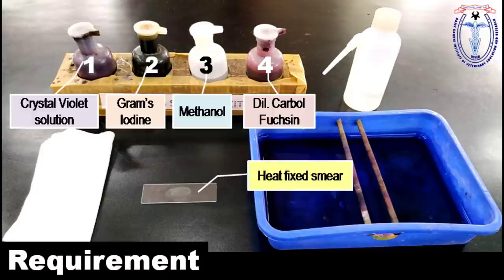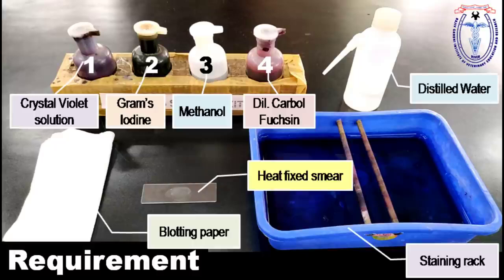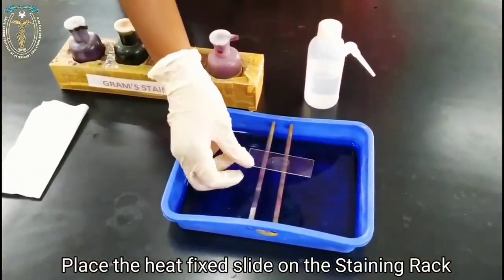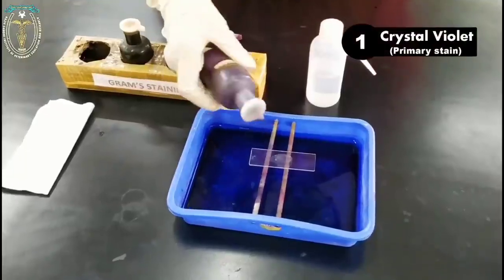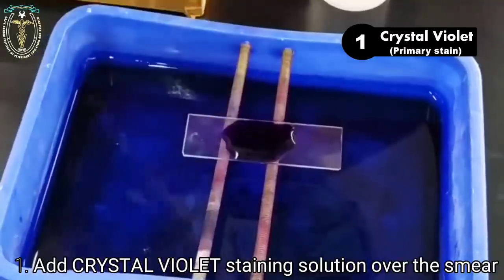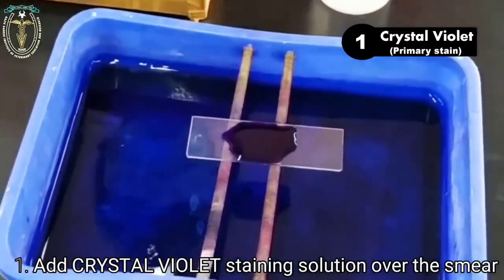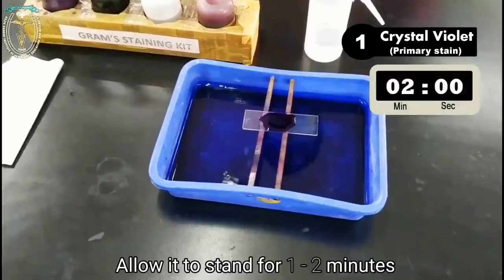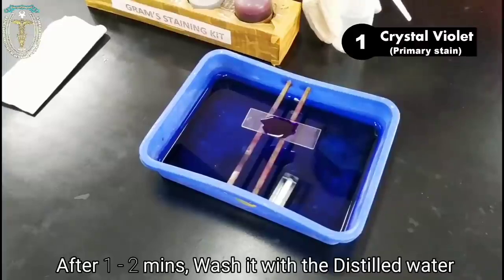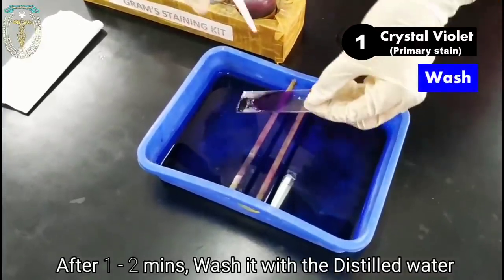Apart from this, the other requirements are the distilled water, the blotting paper, and the staining rack. These are the requirements for conducting the gram staining procedure. After the preparation of the smear, place the fixed smear on the staining rack. First, add the crystal violet staining solution over the smear. Cover the entire smear with the staining solution and allow it to stand for 1 to 2 minutes. After 1 to 2 minutes, wash it with the distilled water.